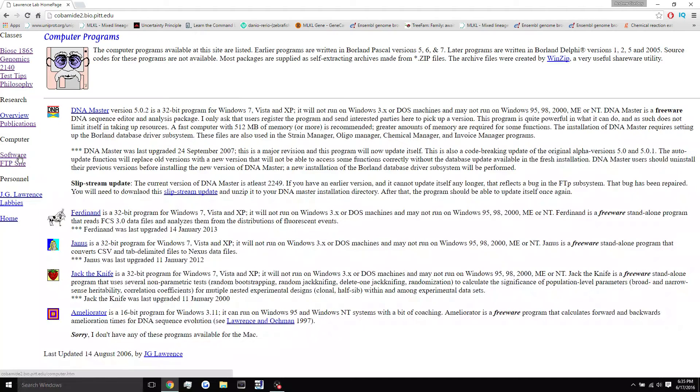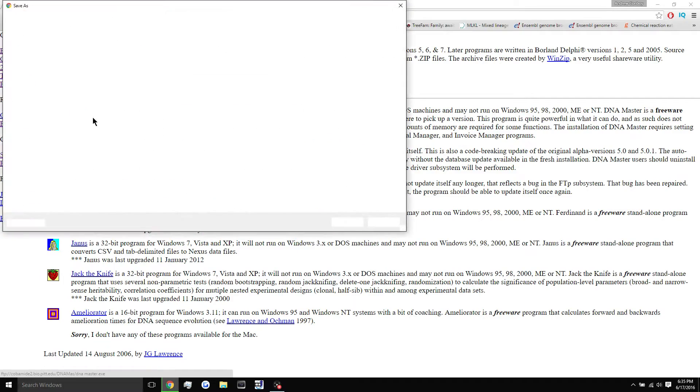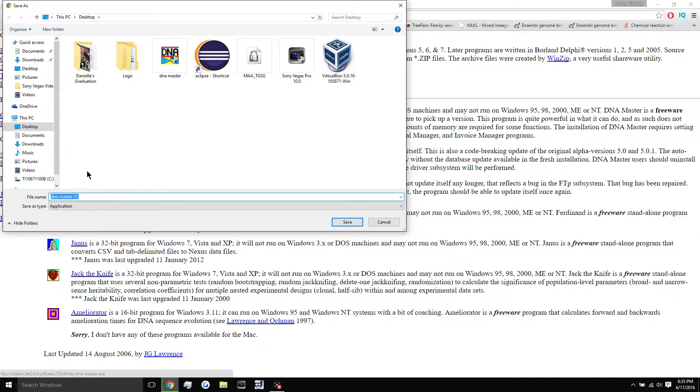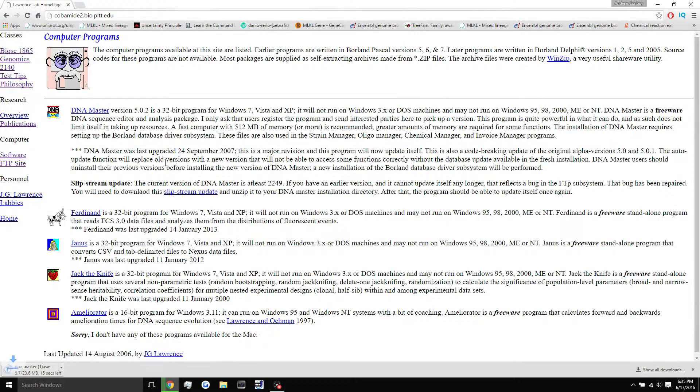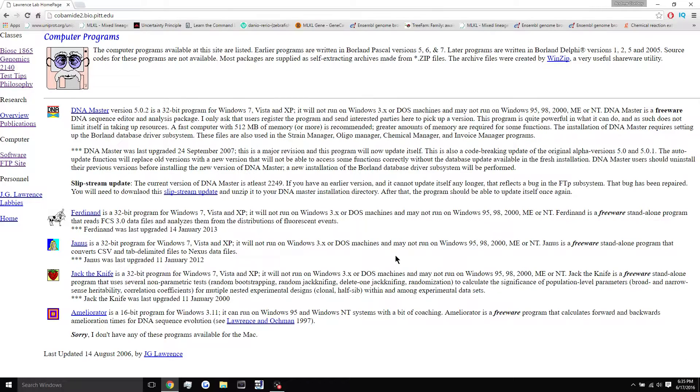You hit software on the left side, and you click DNA master, and it's going to download the application file. So we'll just save it to our desktop, and here it is. It's going to download in just a couple seconds, and we'll open it up when that's done.